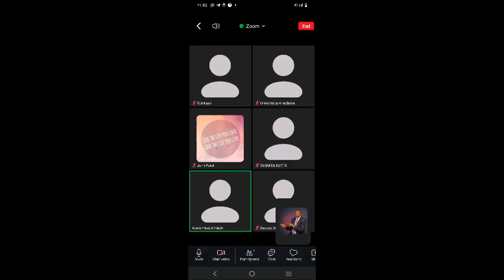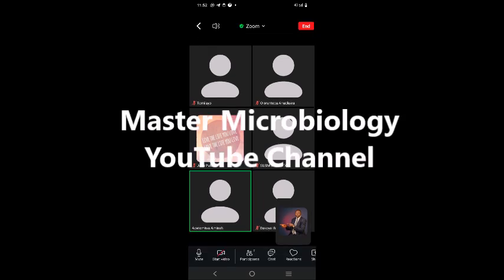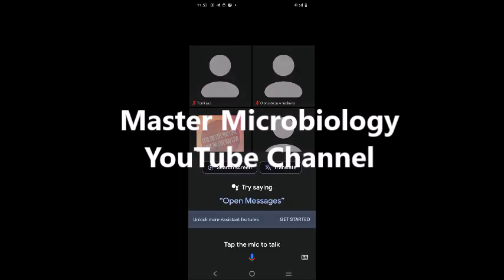Like there is need to validate and monitor whatever technique we are using. Especially when the sterilization processes are being carried out, they need to be validated, and there must be routine monitoring. This is by using various biological indicators to ensure how effective most of these sterilants are.